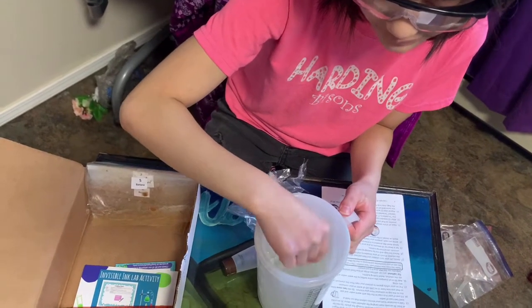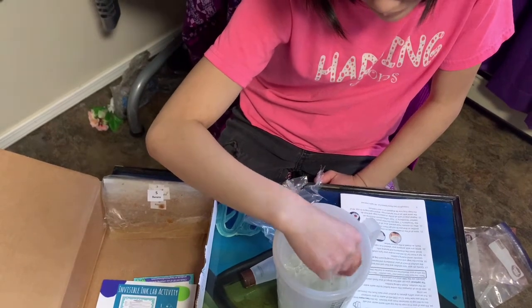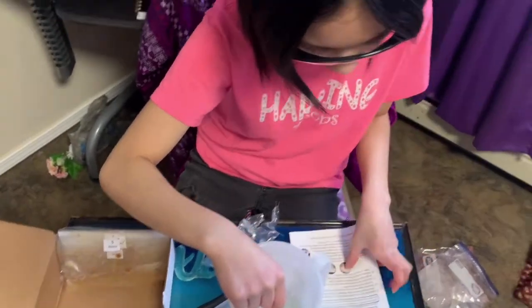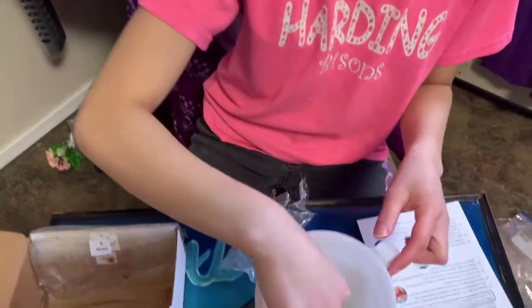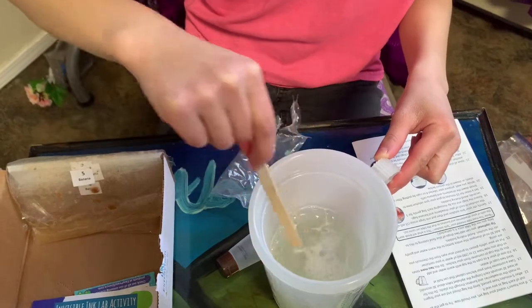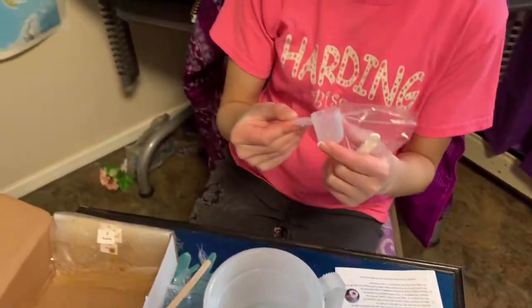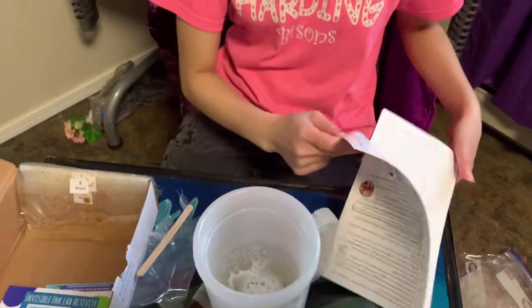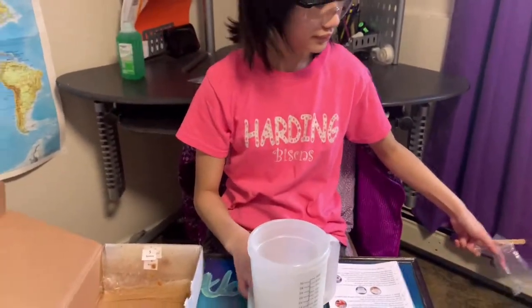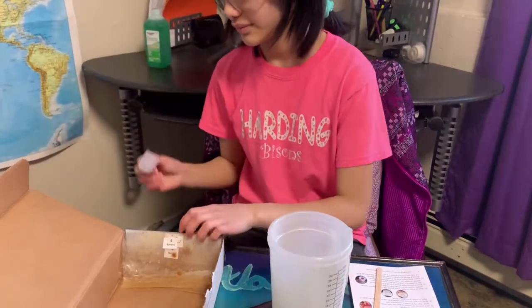All right, then we're going to put 15 milliliters in each of the bags. So here is our solution. This is what they call lysis solution. This is what will break apart the cells of your strawberry and bananas so that the DNA can come out. So we're gonna put that in each bag. Okay. Here's our 15 milliliters. Okay, now we're going to put it in there. This is the 15 milliliters.